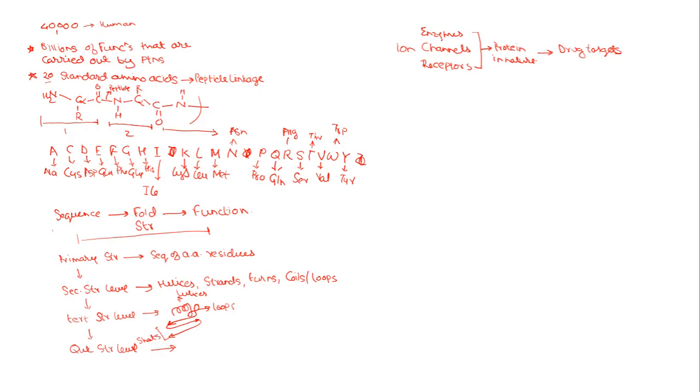Okay, so now, having said this, I hope you agree with me that a protein's structure plays a very important role in its physiology, not only in the context of its application as therapeutic drug targets, but also in sustaining and maintaining life on earth. That is why learning about the structures of a given protein is very important. And this is the exact reason that I have designed this lecture series, to enable you to have an insight into how proteins are, and what can be manipulated, how it can be manipulated, where it should be manipulated.